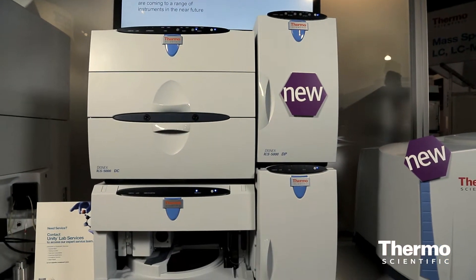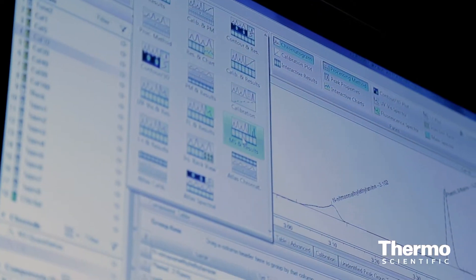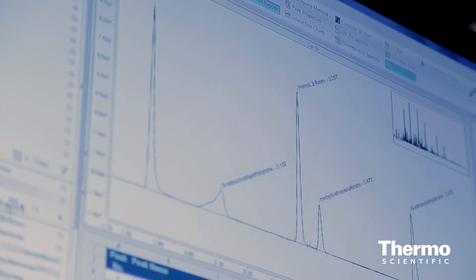The ICS-5000 Plus, as well as all ion chromatography systems, are supported by the Chromeleon 7.2 software, which is just being launched here at PittCon and brings new capabilities to our IC customers, specifically in enterprise environments.